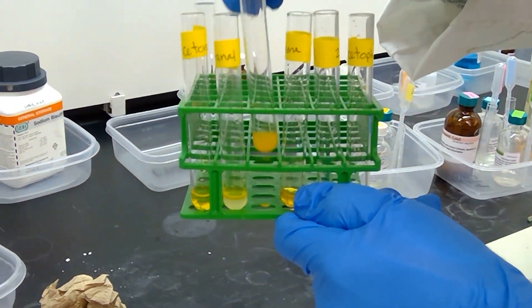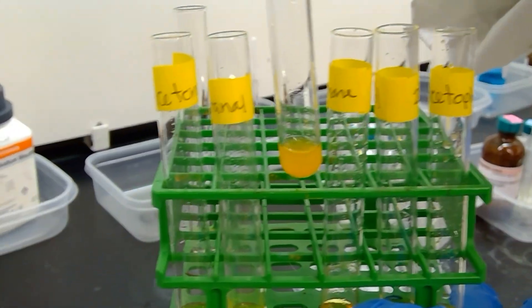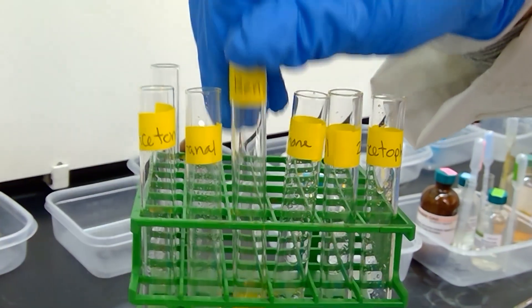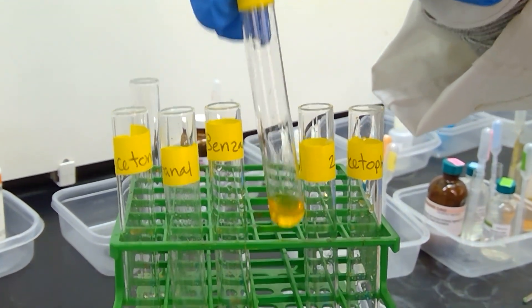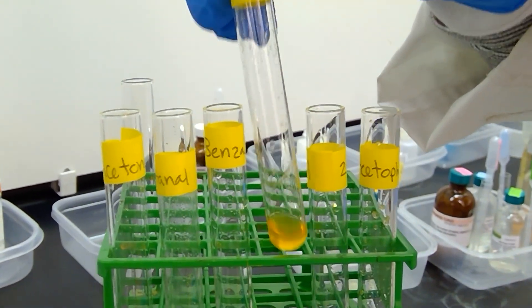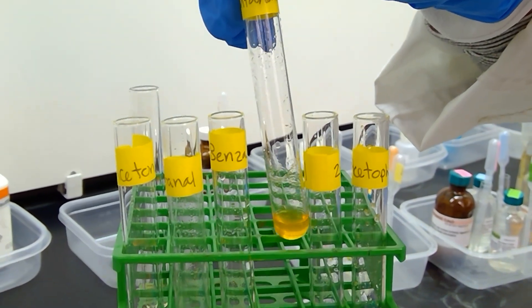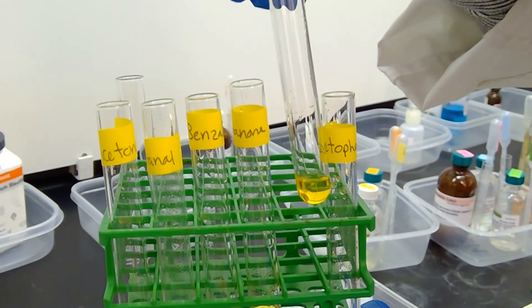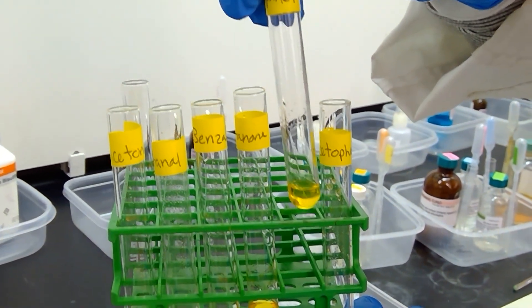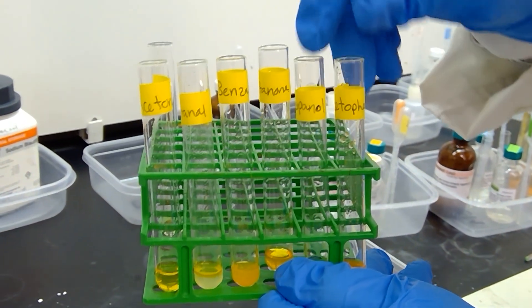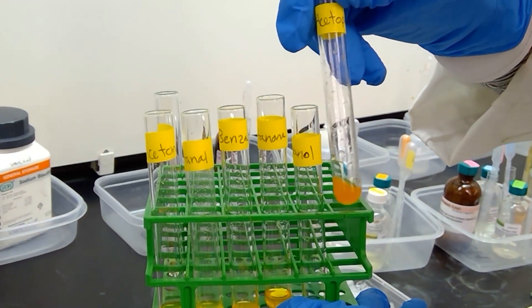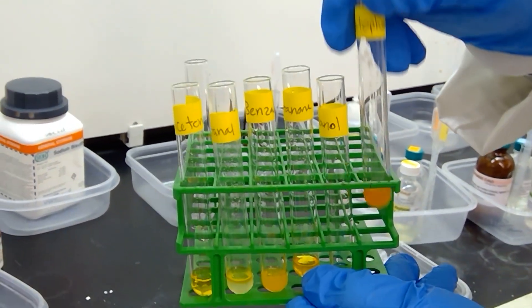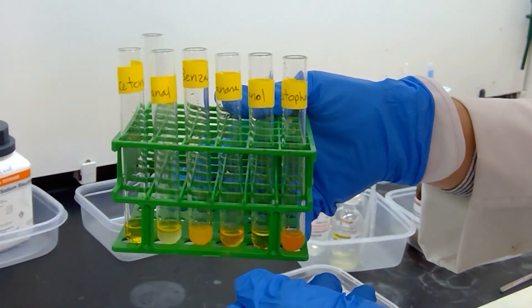For the sample of benzaldehyde, we have obvious orange precipitate forming. This one formed without warming or cooling or even scratching. Next up, we have 3-pentanone. 3-pentanone did show some orange precipitate, also without cooling or scratching. 2-propanol is an alcohol, and we don't see any solid happening in here, which we expected because it's an alcohol. And lastly, we have the ketone acetophenone, which has created some very dark orange precipitate. This has been the 2,4-dinitrophenylhydrazine test.